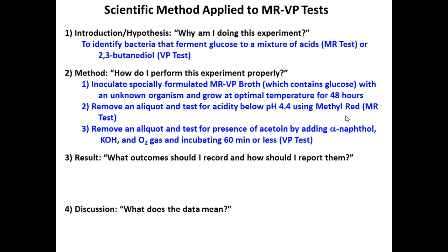Everyone with me on that one? Kind of, sort of, right? So it's a pH test. We read it immediately. If yours didn't have a low pH, what happened to the color of the methyl red? It turned yellow, right? So it was higher than 4.4, right? So you didn't have a lot of acid, so it was negative for this test.